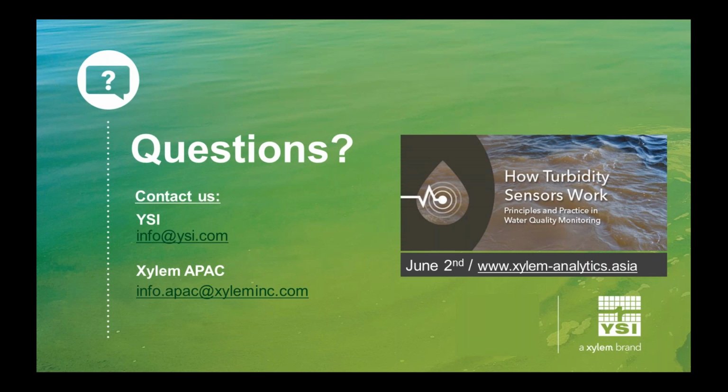You should use rhodamine. The EXO manual describes how to do a calibration using rhodamine. You use water for the 0 point, and then you use a solution of 625 parts per billion of rhodamine for that farther out point that I talked about in the webinar. Now, why are we using rhodamine instead of chlorophyll? There are a few different reasons.